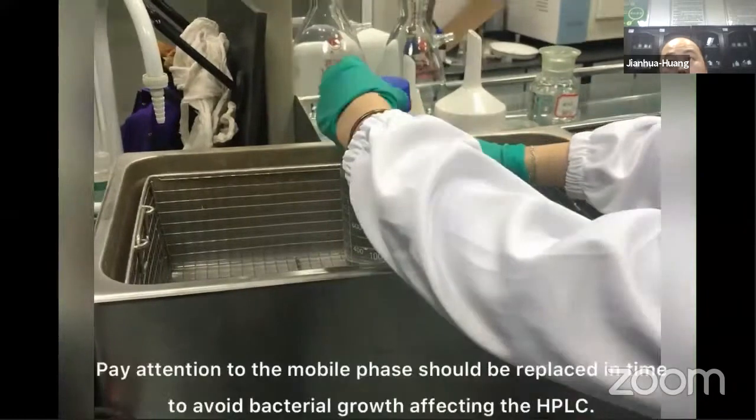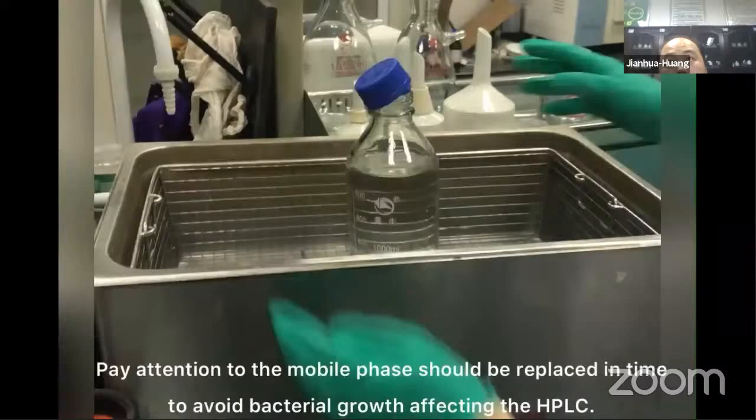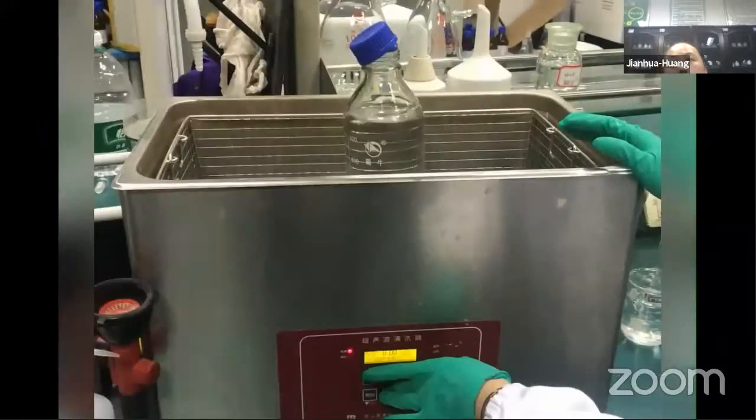the mobile phase. Pay attention: the mobile phase should be replaced in time to avoid bacterial growth affecting the HPLC.